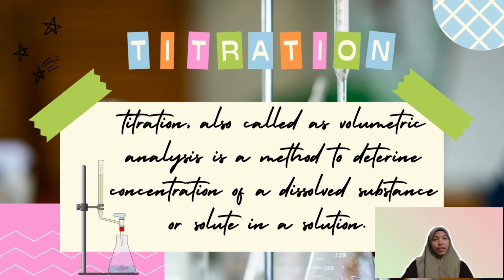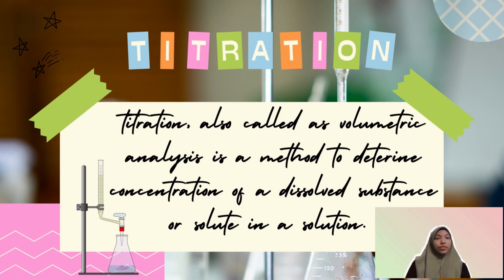Firstly, do you know what is a titration? Titration, also known as volumetric analysis, is a method to determine concentration of a dissolved substance or solute in a solution.